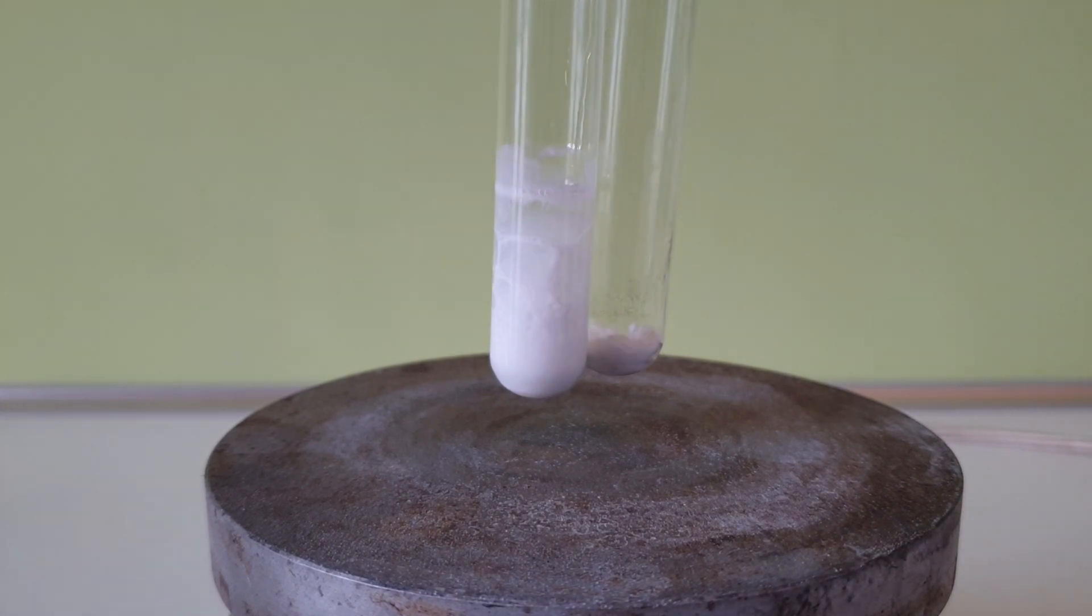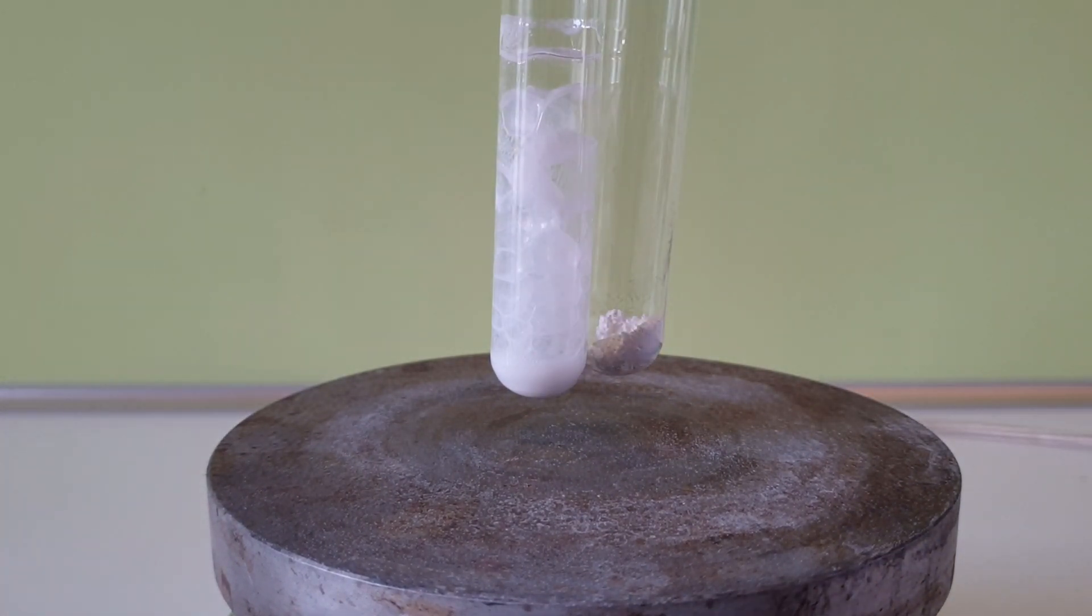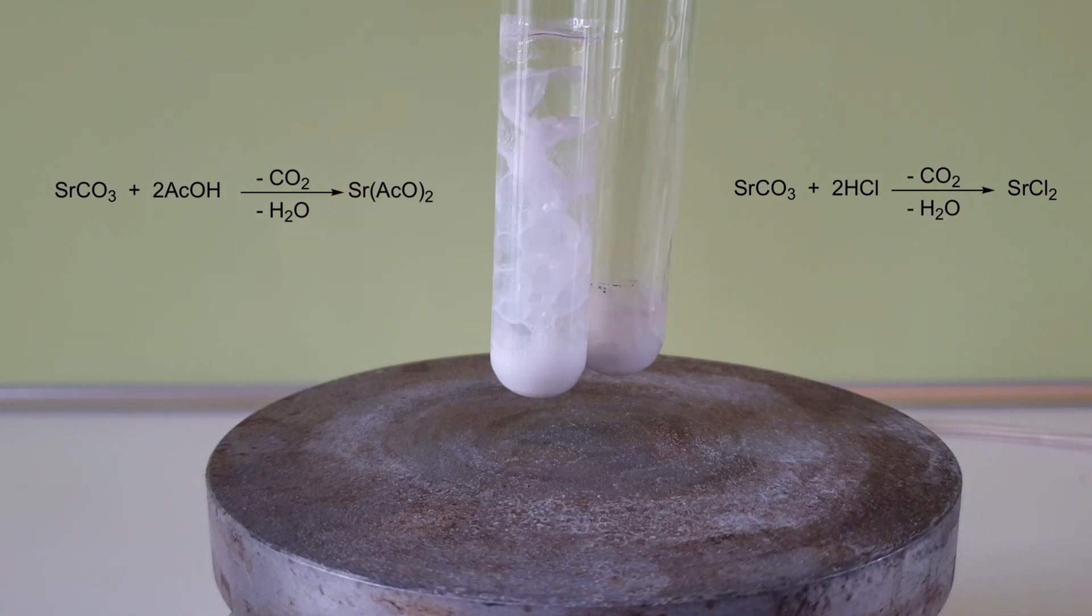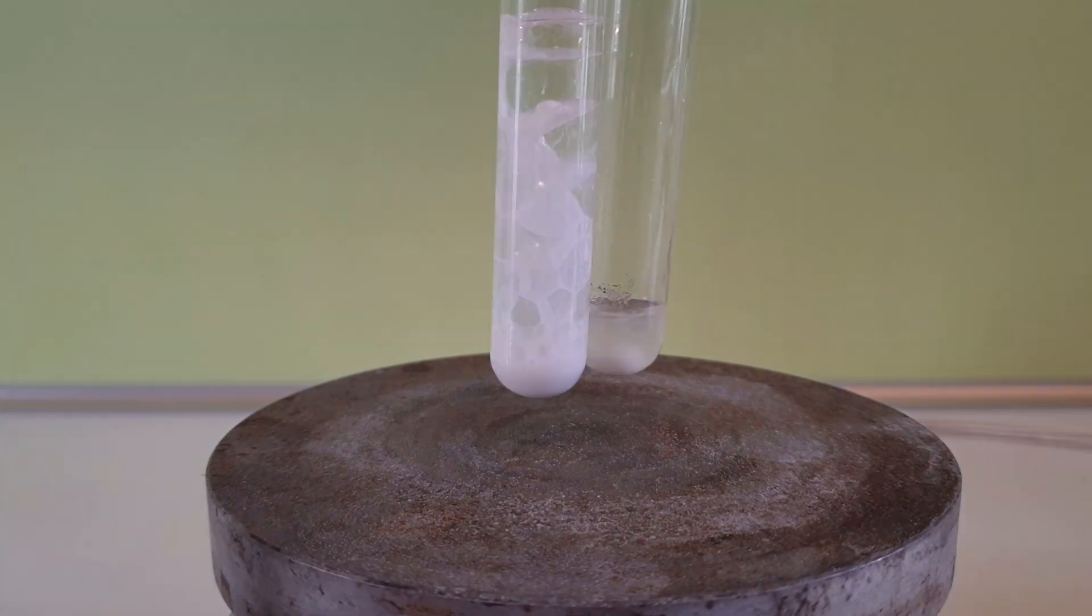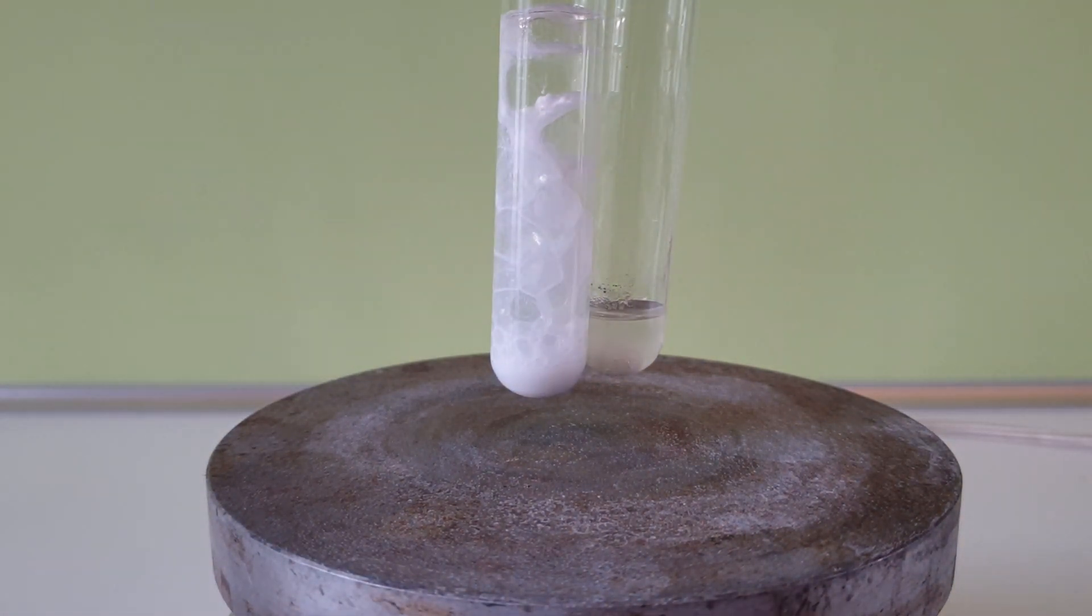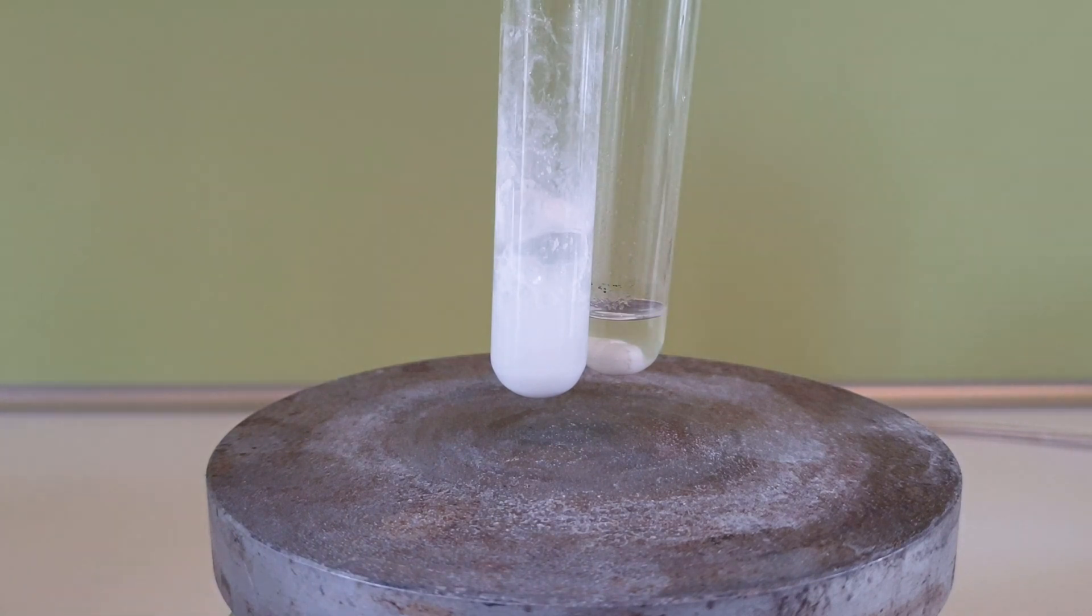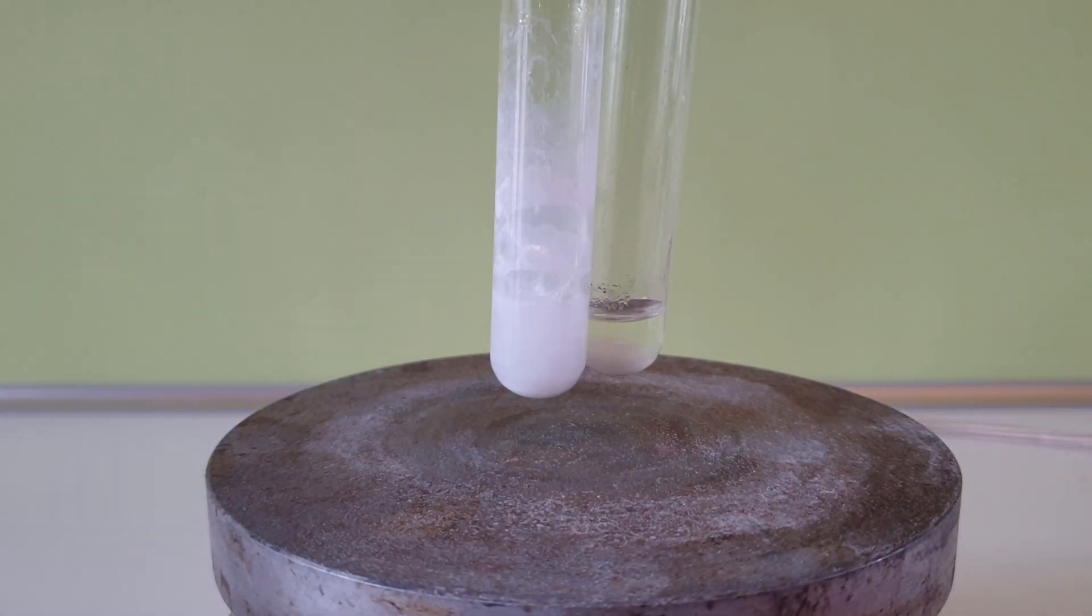Now I add two milliliters of the corresponding acid to the carbonate. You can see an immediate reaction between the carbonate and the acid forming the soluble salt. The acetic acid mixture decided to be a little bit annoying and pushed solid up with the CO2 bubbles, so I added a little bit of water to push everything back into the liquid.